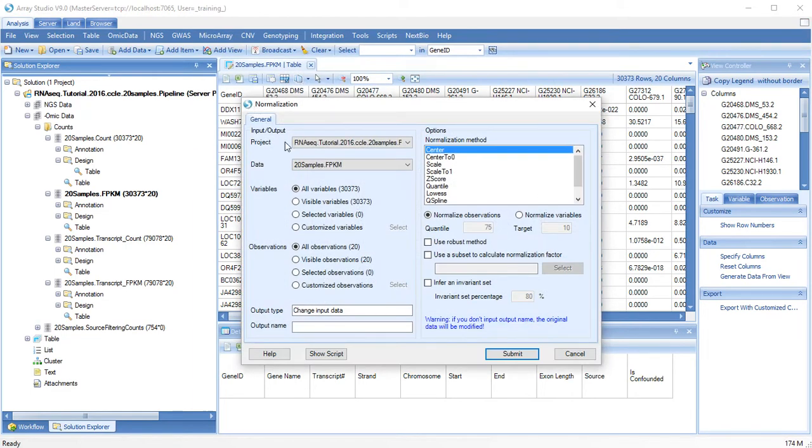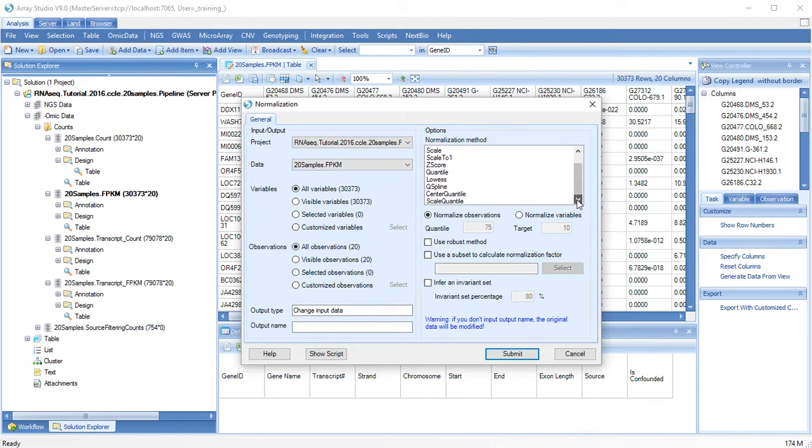We will use our gene-level FPKM data and normalize to the upper quartile.